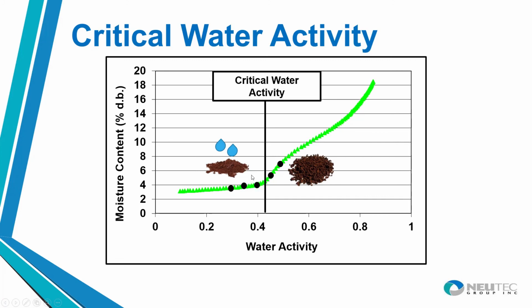So having a good understanding of this, we were able to look at it at multiple different temperatures to identify for this company exactly where that critical water activity is and how it could be impacted by potential abuse conditions.